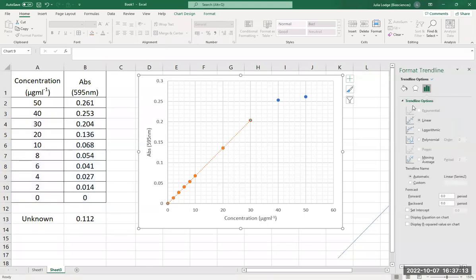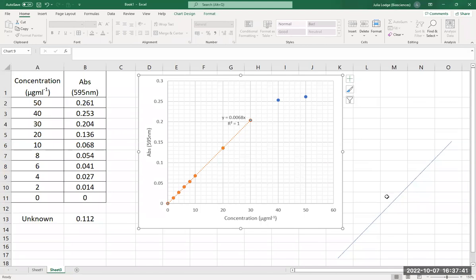So Excel actually has a number of different trend lines it can add, but in this case, we're perfectly happy with a linear one. You can set the intercept to 0 because you know that that first value is a true 0. And you can also ask Excel to display the equation on the chart and the R² value. I'm going to do all of those, and then basically we're finished with this. Close it down.